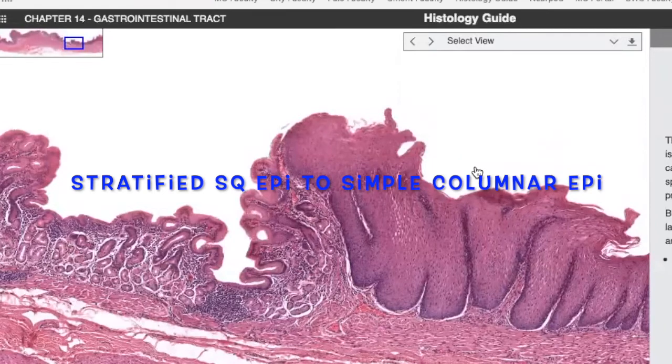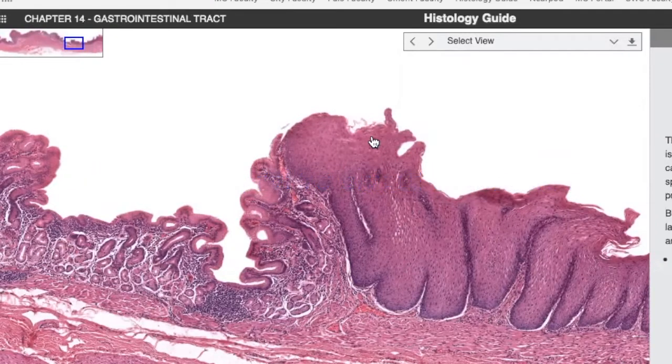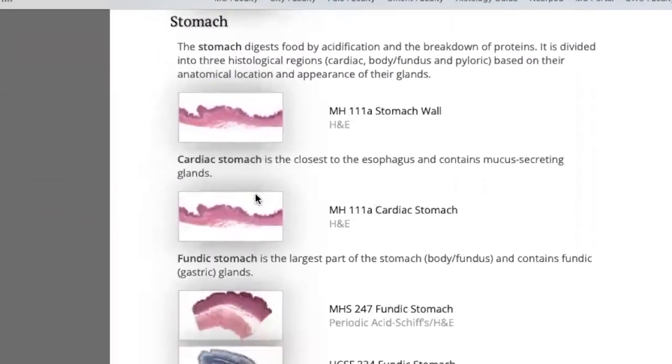The only other region, right, would be the rectal anal junction, the opposite way, right? So if this was proximal and this was distal, this might be the rectal anal junction, but this is proximal and this is distal. So food is going this way. This is the transition going from the esophagus to the stomach. All right, so then we're moving.